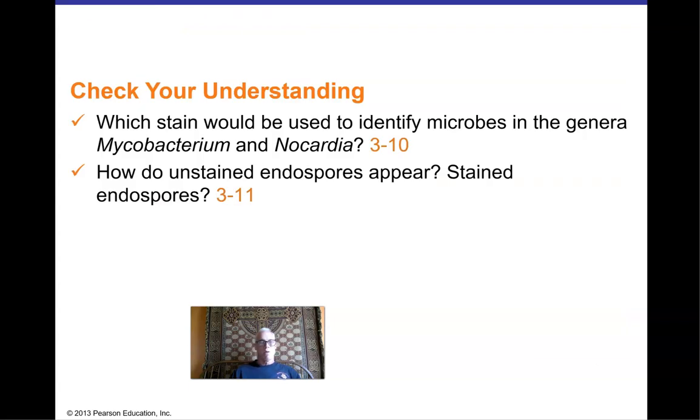All right, so that's our story for viewing microorganisms in the microscope. I hope you enjoyed that chapter. It is pretty mind-bending to think of how small the things are that we can see in different types of microscopes. But again, remember, in microbiology, on a routine basis, we're going to use compound light microscopes, and we're going to use fluorescence microscopes, dark field, bright field, phase contrast, and that's pretty much the extent of it.